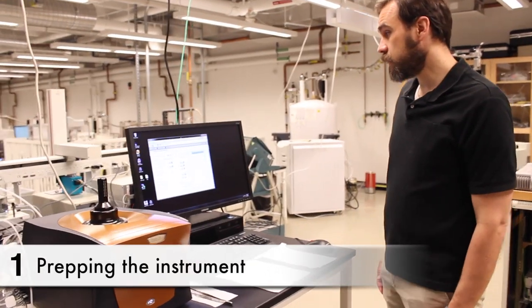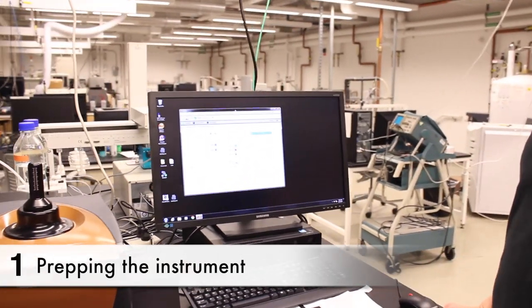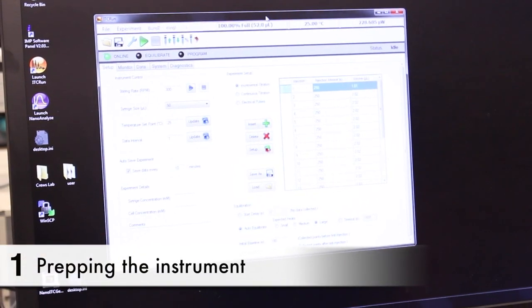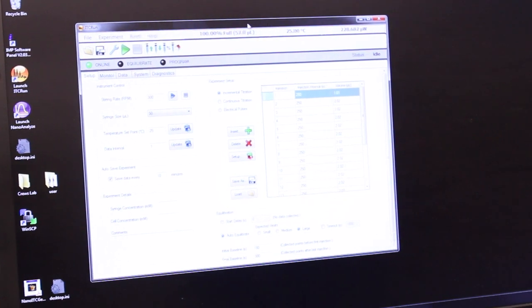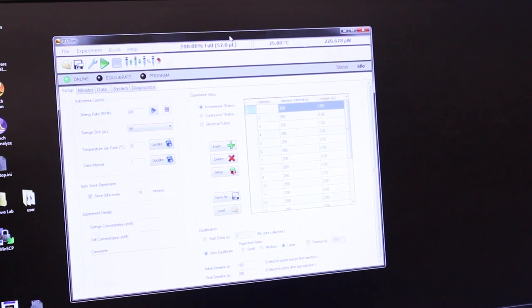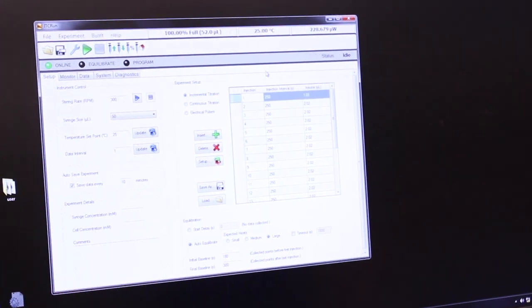When you come to use the instrument, it should be logged in to the ITC user account, which is the account that is used in between one user's run and the other to make sure that the instrument is just in idle mode, but is regulating the temperature.